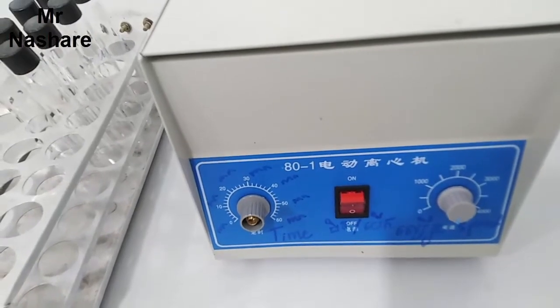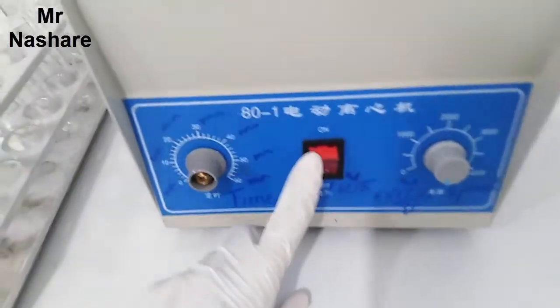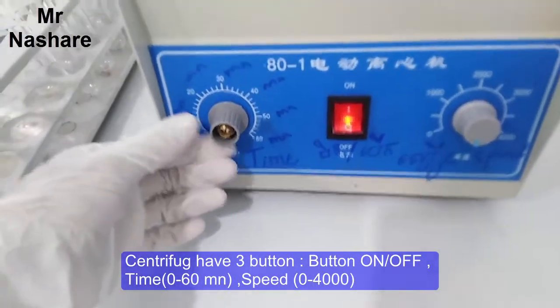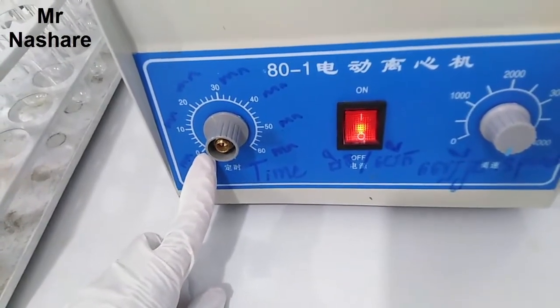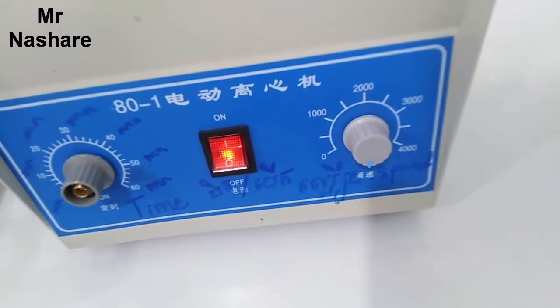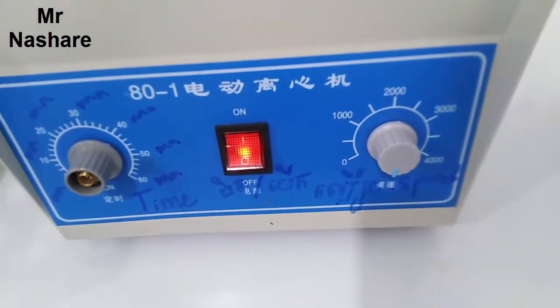On the function of the machine we have three functions. The first is we use the on button, then we control the time — time starts from 0 to 60 minutes, or one hour. The speed of the machine starts from 0 to 4000, and we control it at the same point.